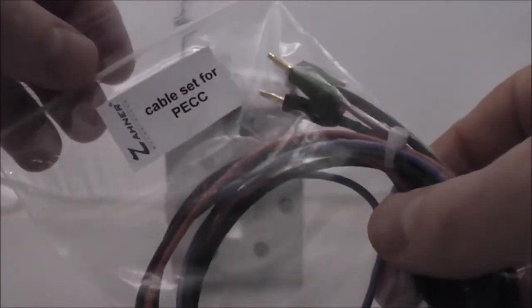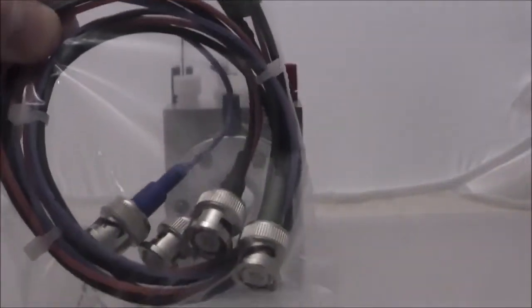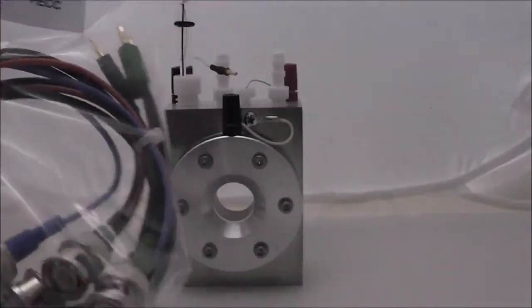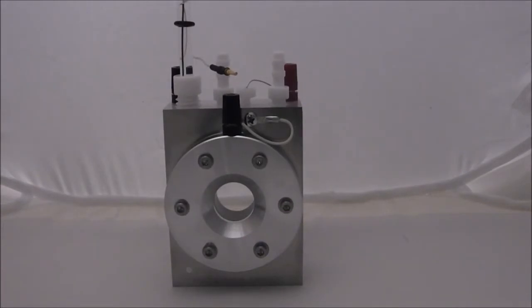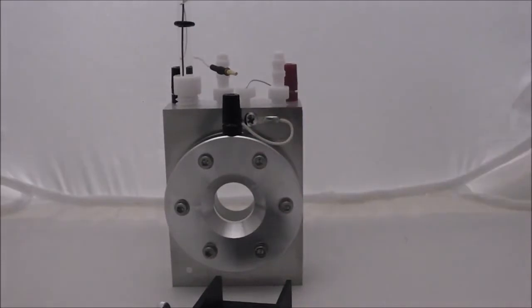And then a pack of BNC connectors so you can connect to the front of the Zana Potentiostats and their SIMS systems. Zana makes a really nice job of including all the accessories.